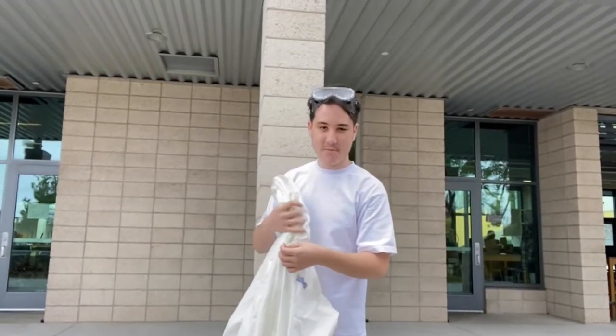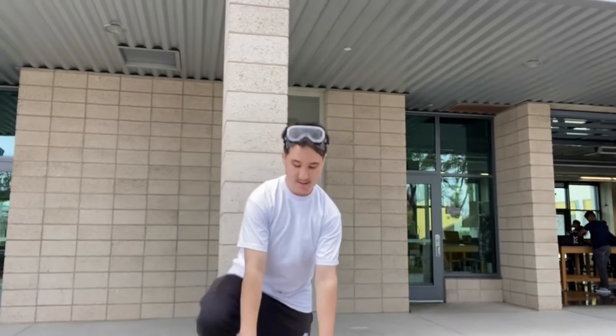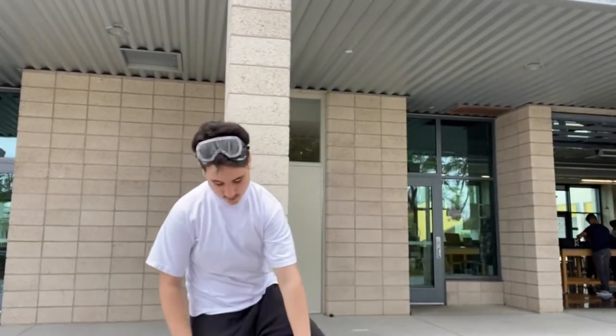Putting on a Tyvek suit is pretty easy — it's like putting on any other suit. First, zip it open, get it open, put your legs in. Be careful; I tripped like 30 times trying to put this on.